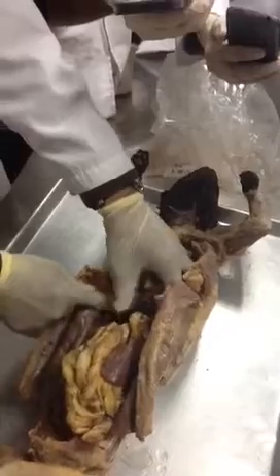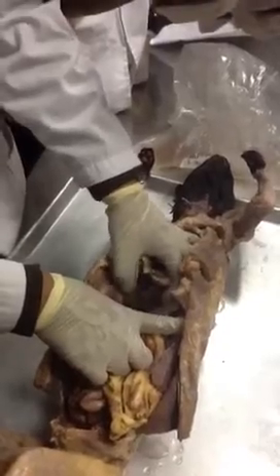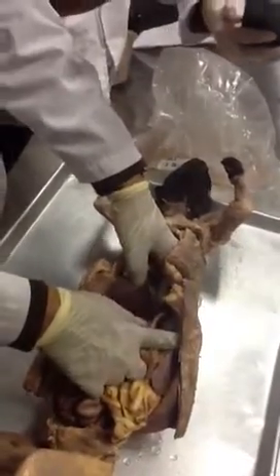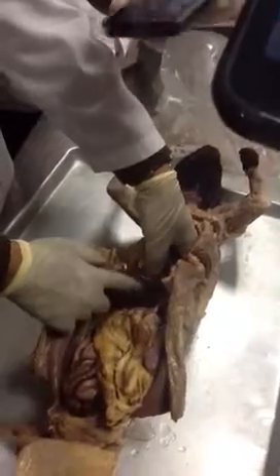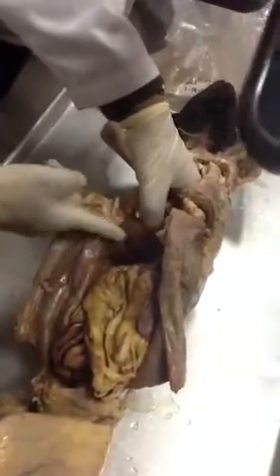We cannot see this thing clearly over here, but can you see some spot actually? Like something dark. Normally this thing should be here, but this cat is maybe mutated.